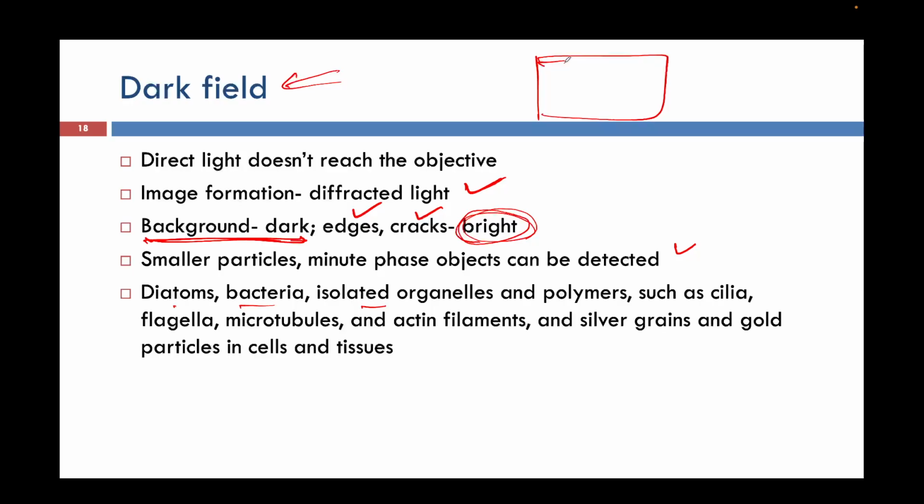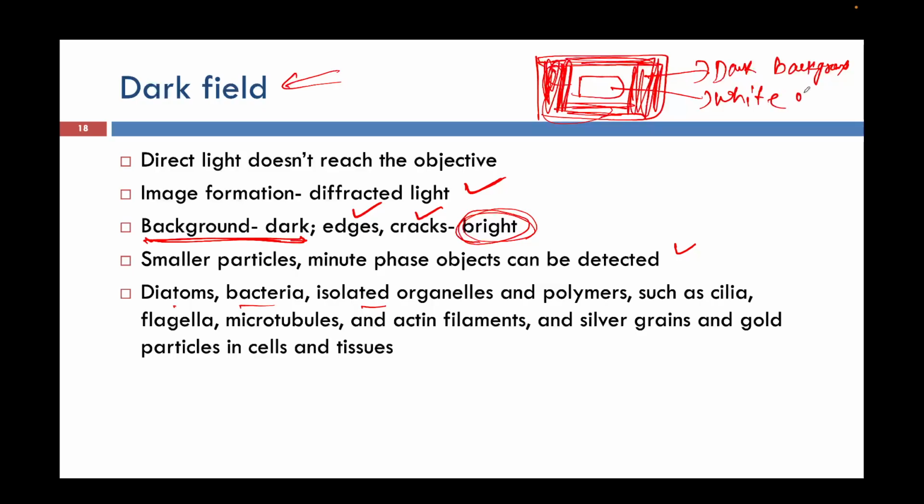The entire background is dark, this is the dark background, and this is the white object.